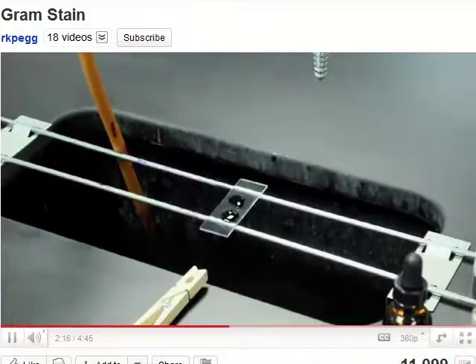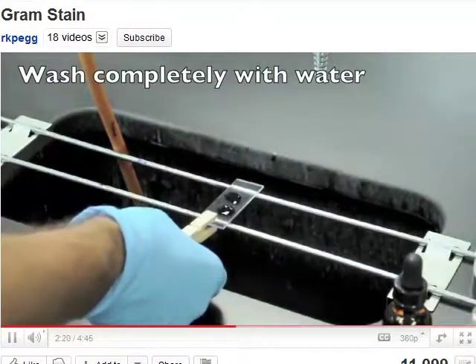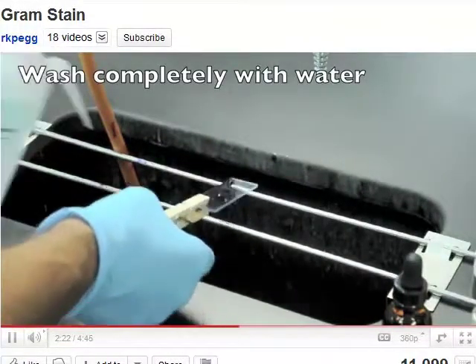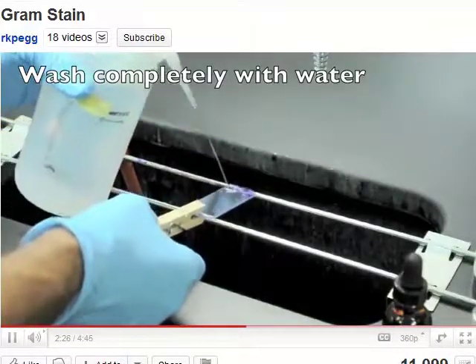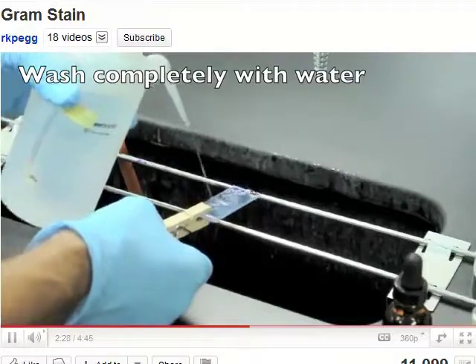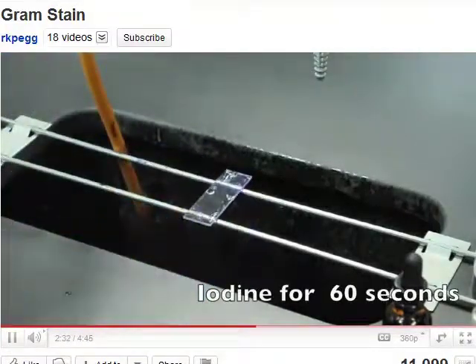And then we need to wash the slide off. So we're going to hold it with the clothespin, and then using distilled water, we're going to wash it very vigorously. And as you recall, the crystal violet is going to be taken up by both cells. Now you can see we've washed both the back and the front of the slide.